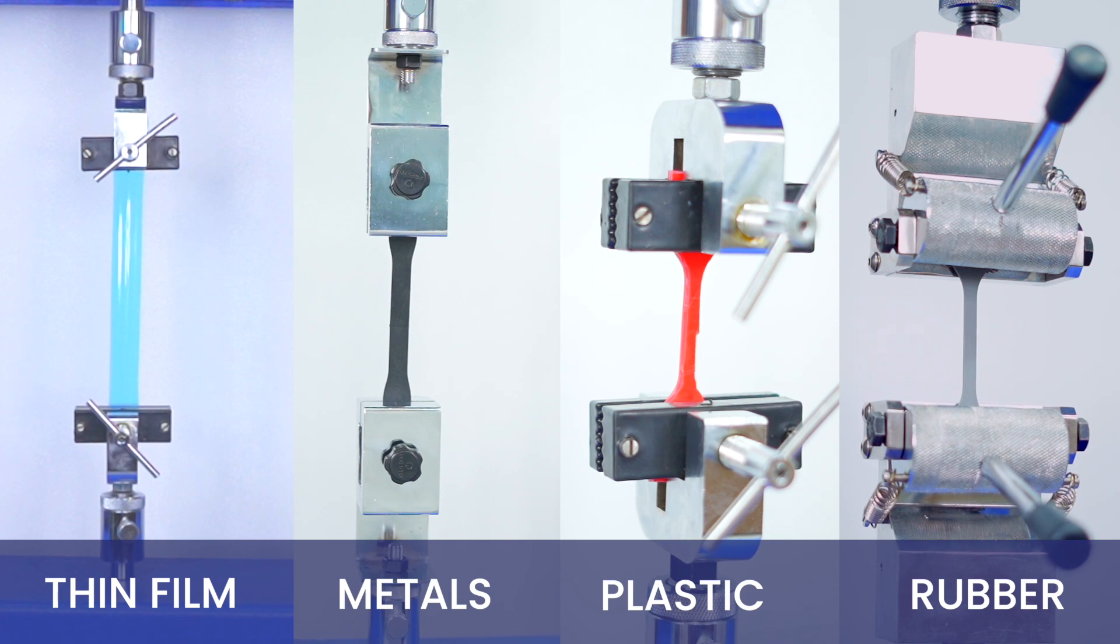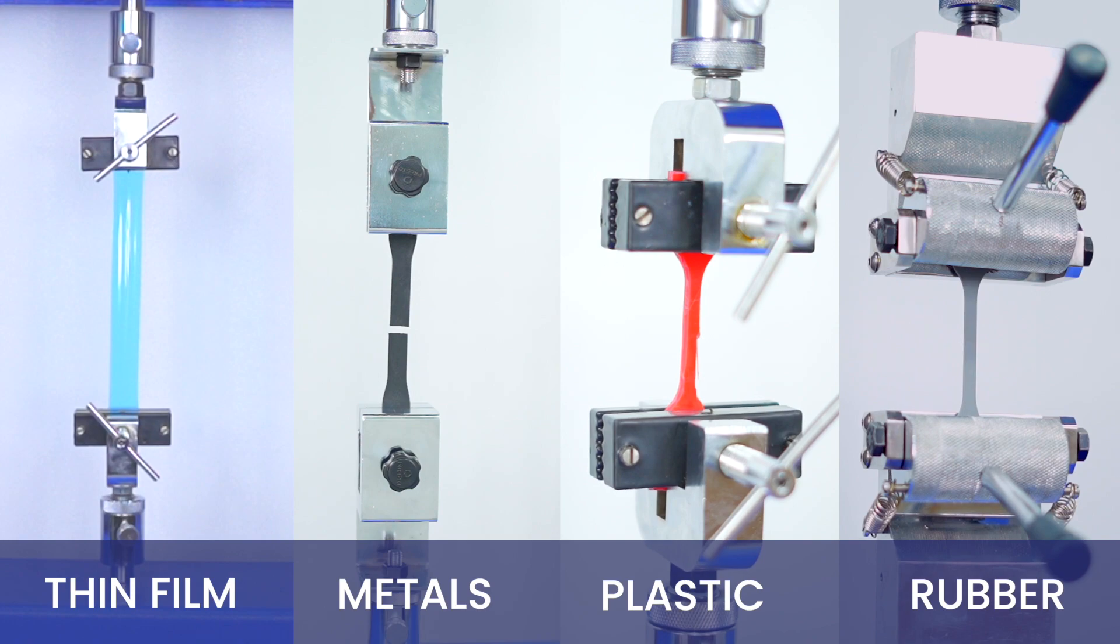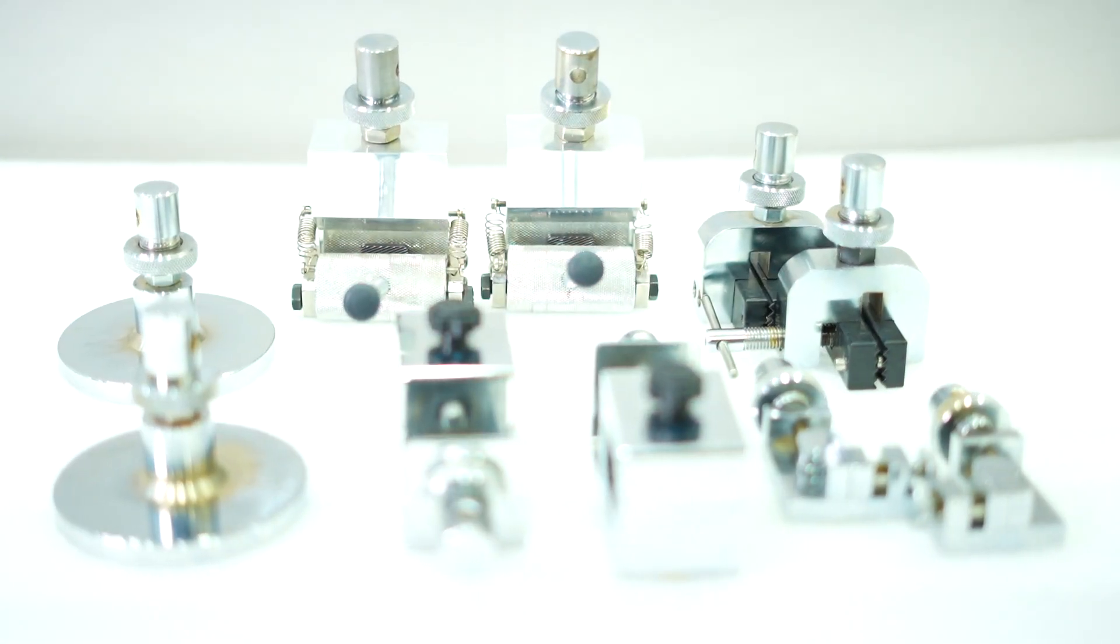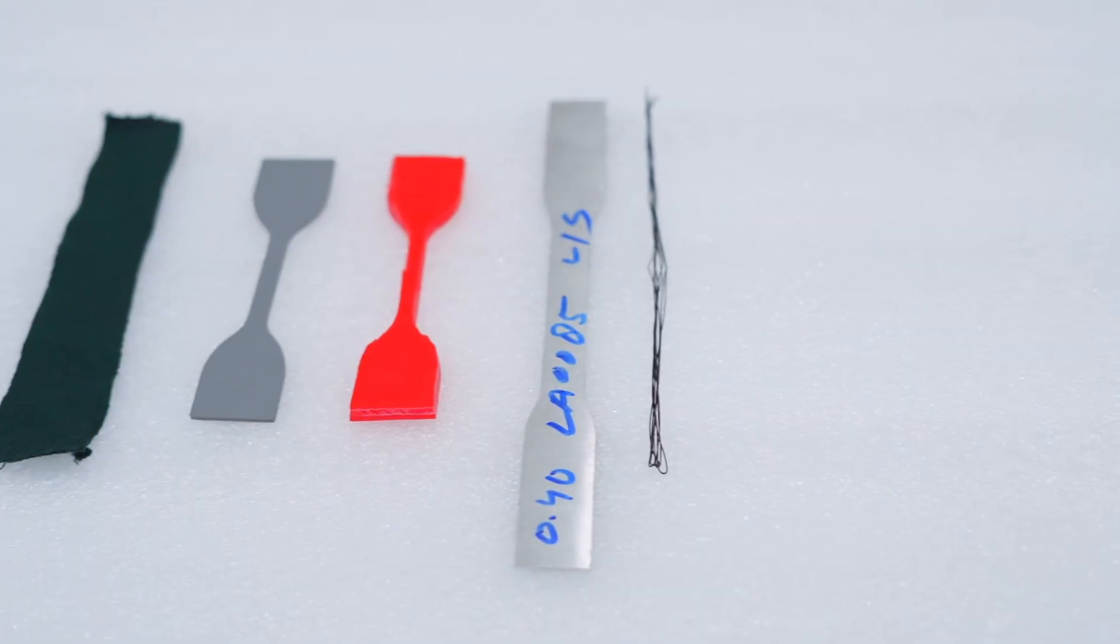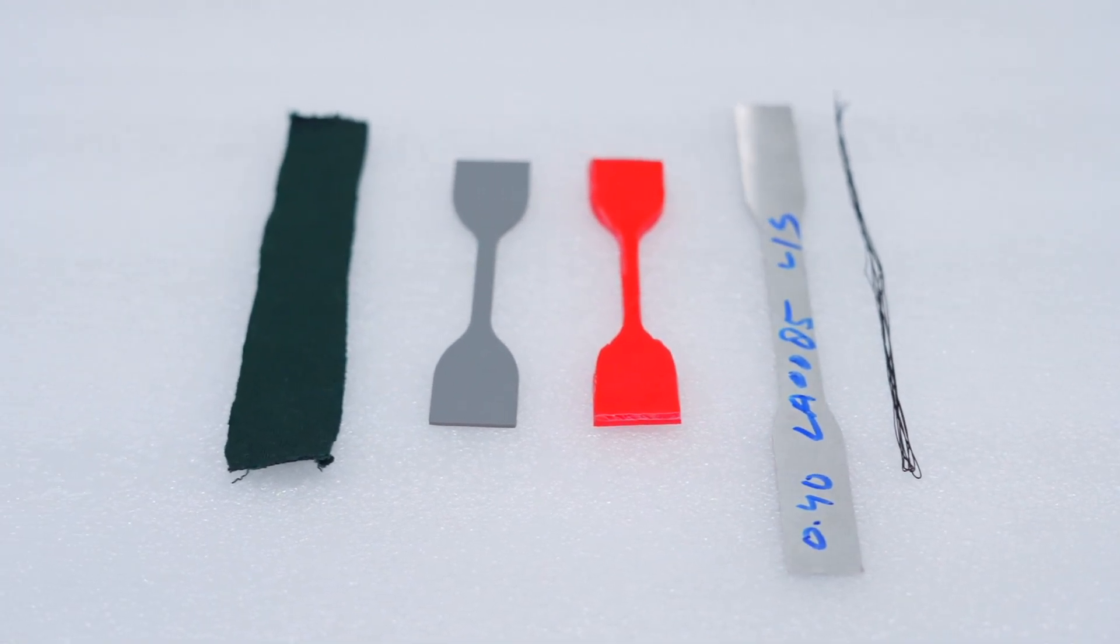Commonly tested materials in this universal tensile testing machine include thin films, metals, plastics, rubber, and more. The tensile tests can be conducted using different types of grips, fixtures, and accessories. These accessories are designed to accommodate easy tensile testing on different types of samples.